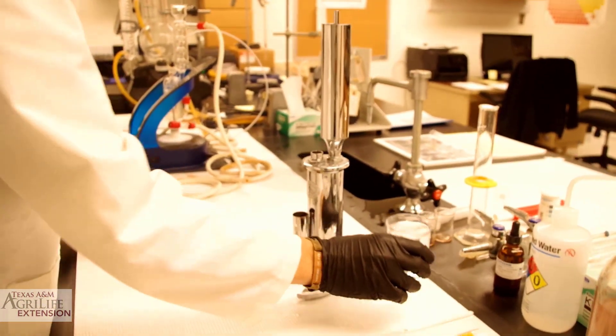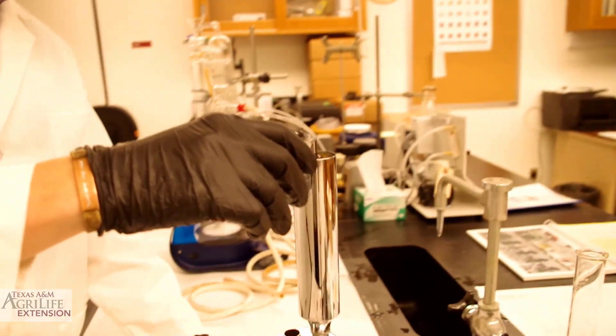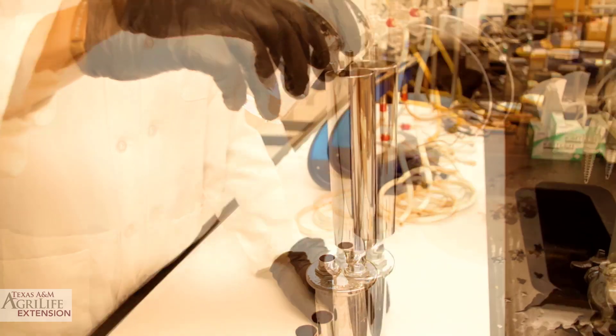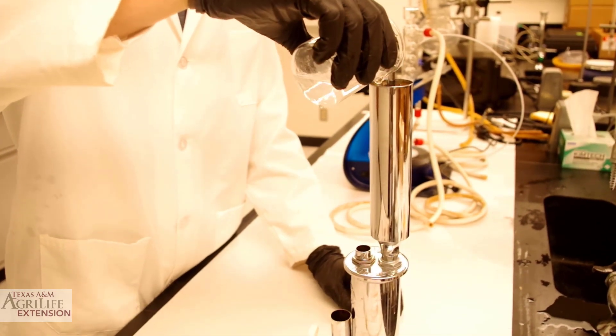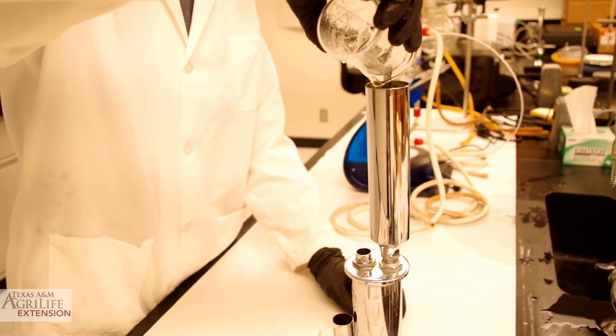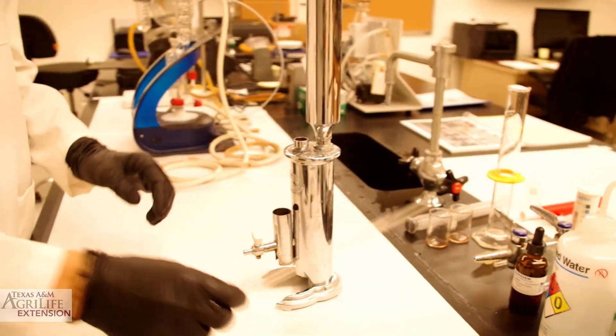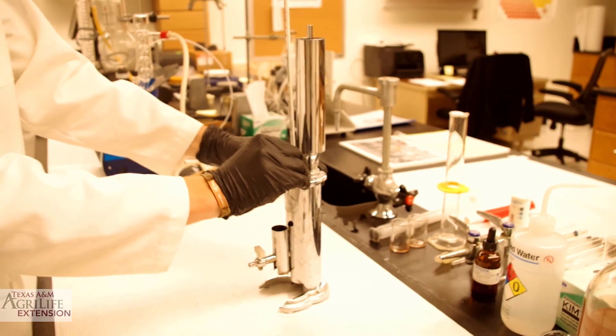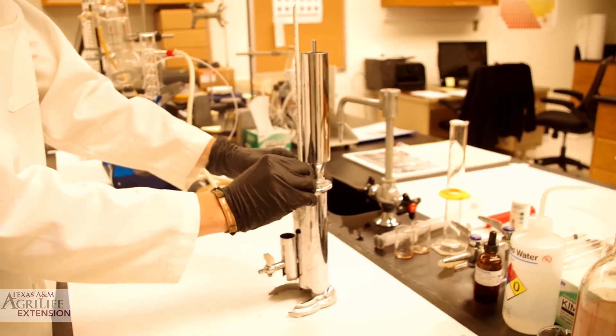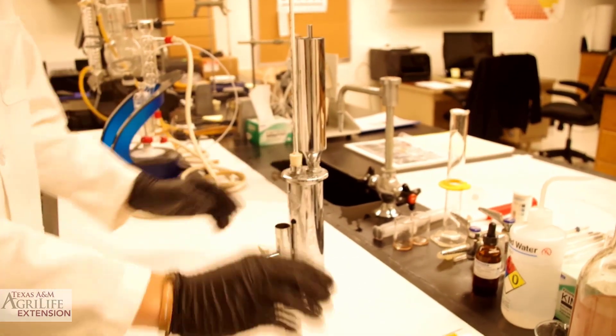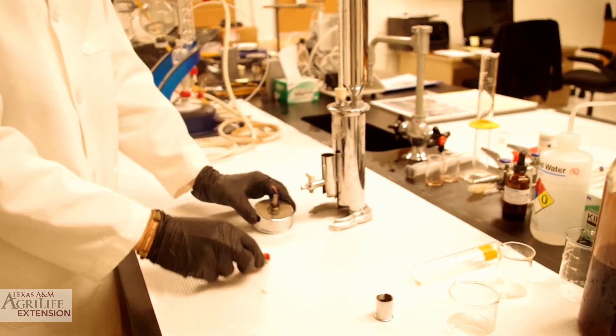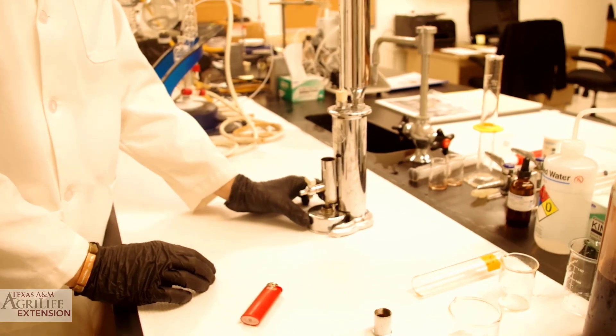We now add cold water to our cooling chamber. Make sure you fill it all the way to the top. Now place the thermometer on top of the boiling chamber. Light up your burner and place it underneath the boiling chamber.